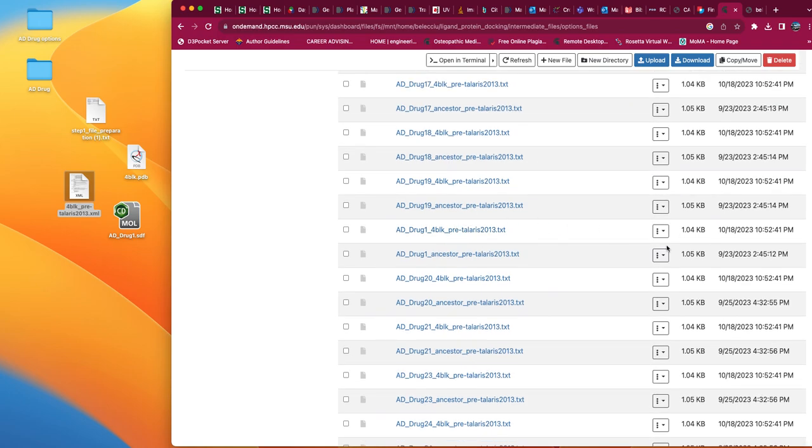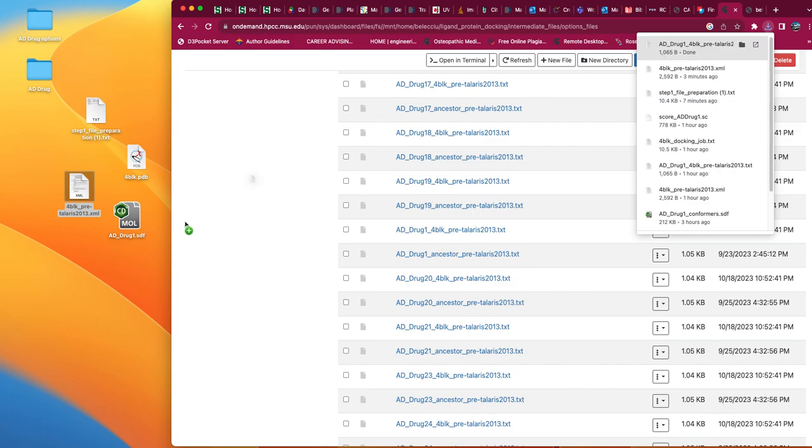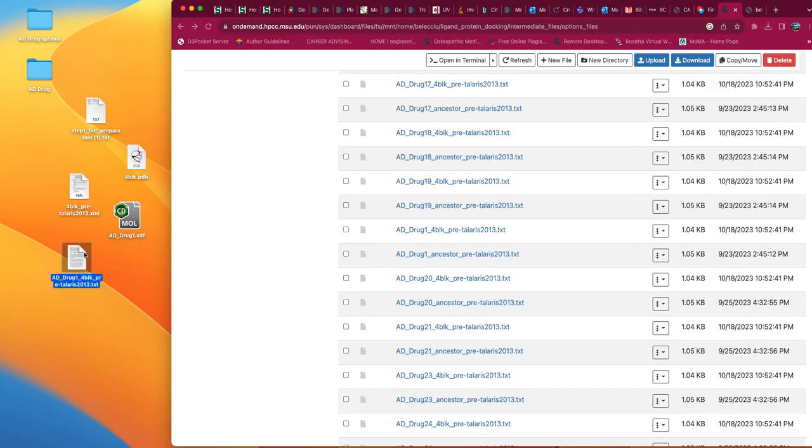There we go. Okay, let's download this file and look at what it tells us. Perfect.